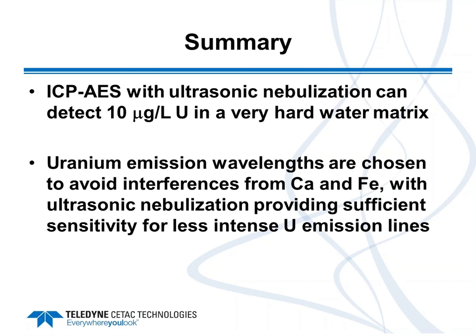To lower that further, you would need a membrane desolvator. And that is available as a module that can be added to an ultrasonic nebulizer. And in that case, typically you will push cerium oxide to cerium ratios well below 0.1%, generally at 0.05% or lower.